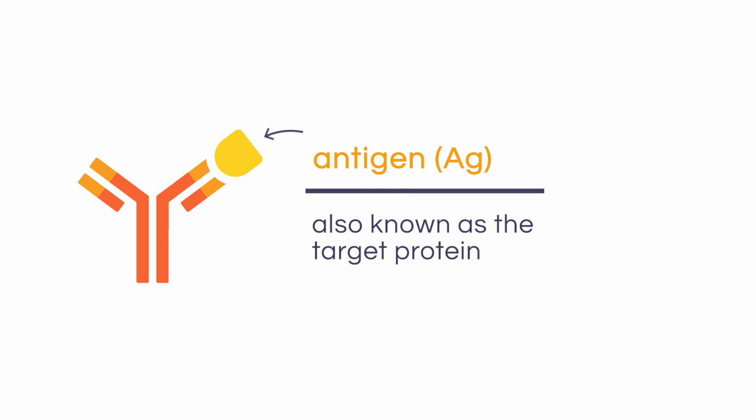In this lesson, we'll talk about how primary antibody detection works, and we'll also examine the three main types of primary antibody that you can choose from.